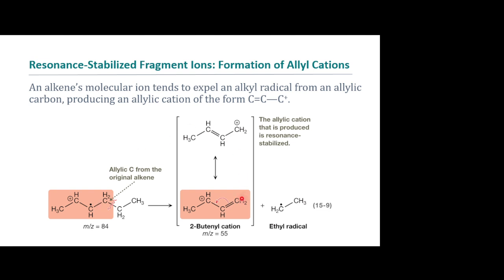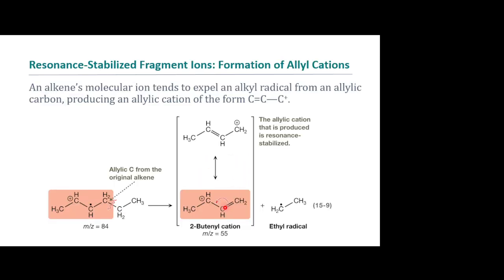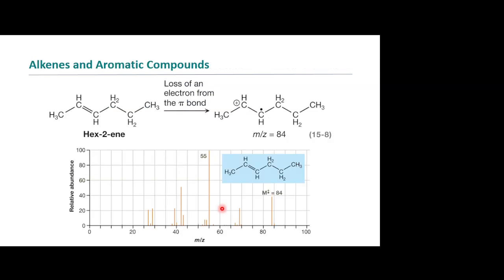All right, and you'll notice that in the previous structure here, this was the most stable peak. See the 55? Right there. Did I lose anybody there?